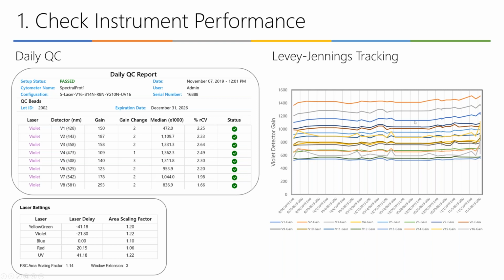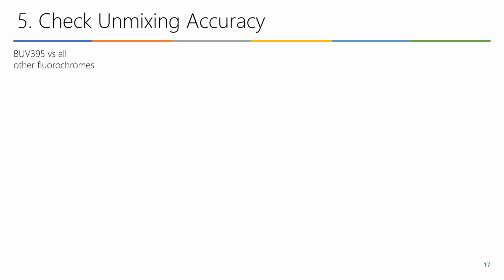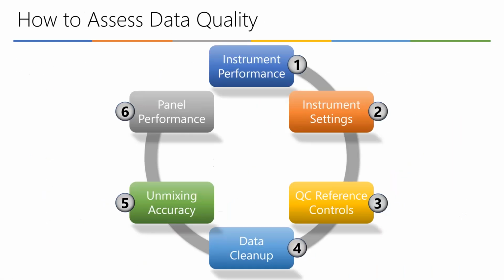Okay, thank you, Deanna. We have one question about single stain controls, because in SpectraFlow, there's that feature where you can store them and reuse them over time. So assuming that you have an optimized panel and you've optimized your controls and you're thinking about storing them, what are the considerations for how long you can keep reusing them, or any risks you might encounter in reusing those controls that you should think about?